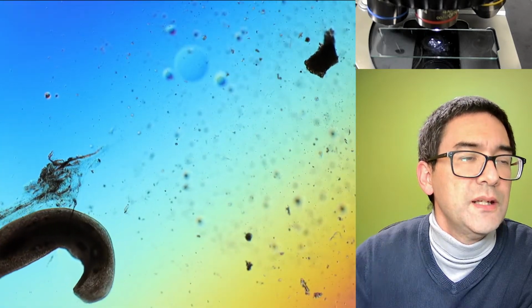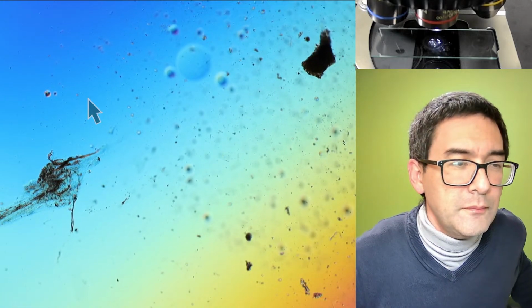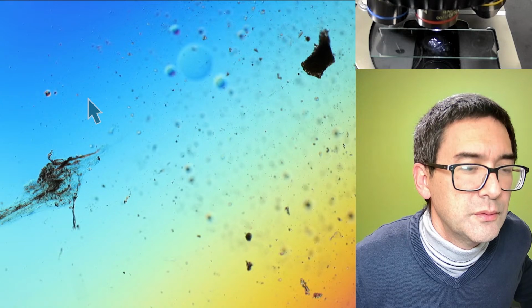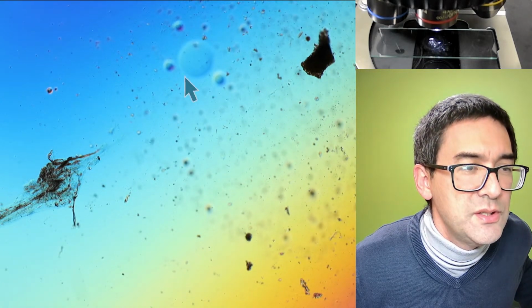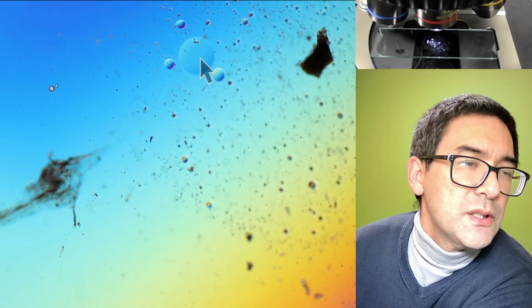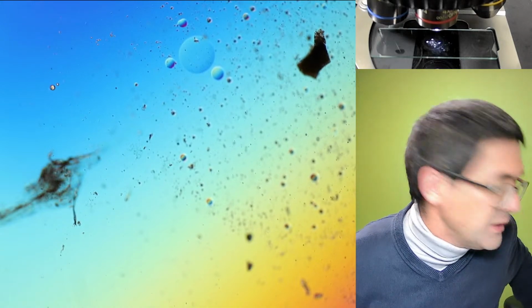Also interesting. Do you see this round thing? I'm going to use an arrow over here. Do you see this here? Where's the arrow? I have to be able to move the arrow now. Just a second. Do you see this here? So it looks a little bit like a fat droplet because, as I mentioned, this spice is actually fat soluble. So maybe there are some oils in here as well.